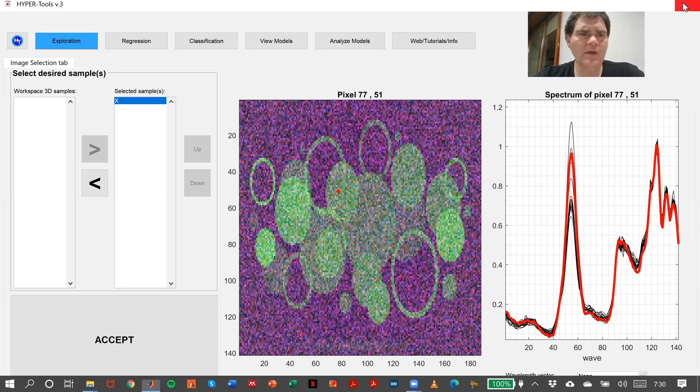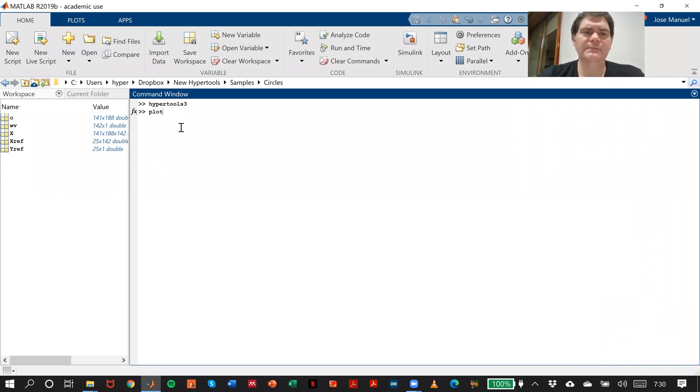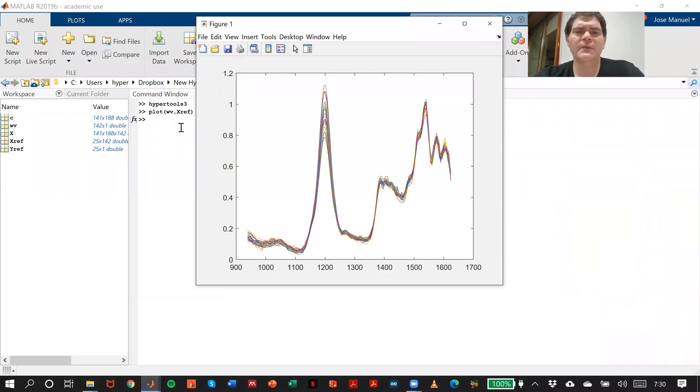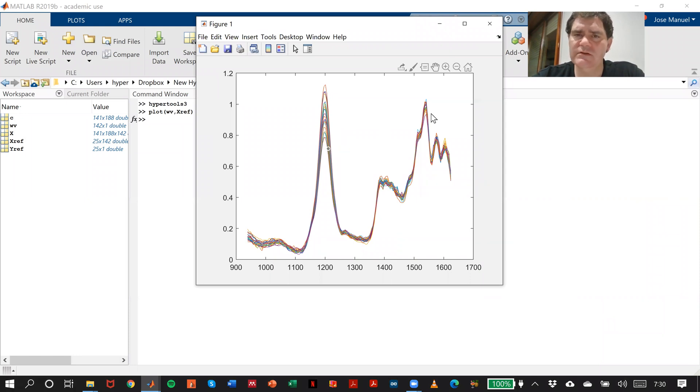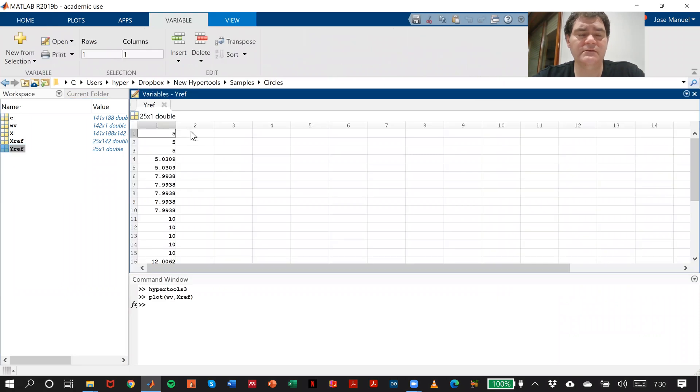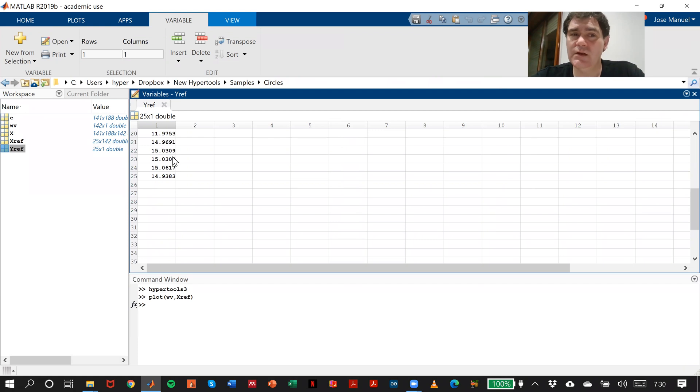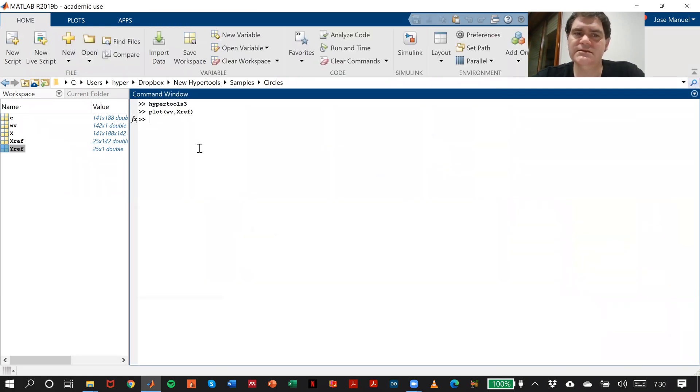We have this matrix Xref, which are my spectra that I will use for developing the calibration model, and Yref with values of concentration that go from 5 to 15. Remember this is just a simulation for showing you.